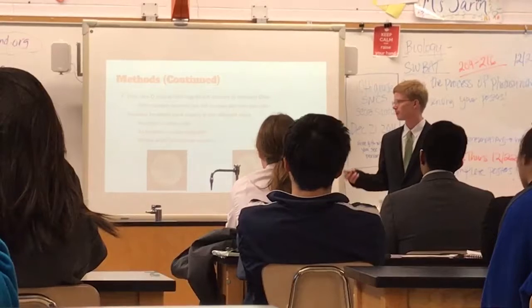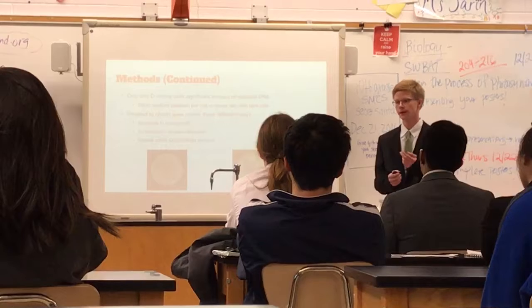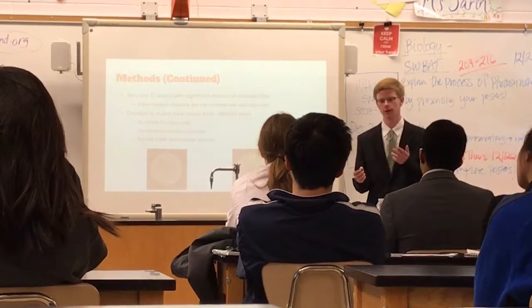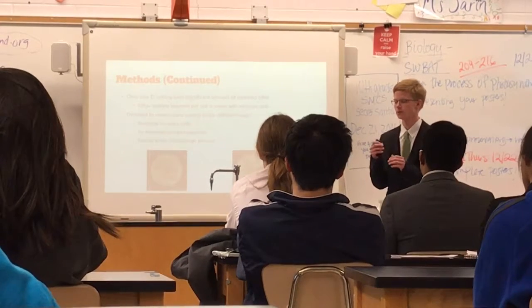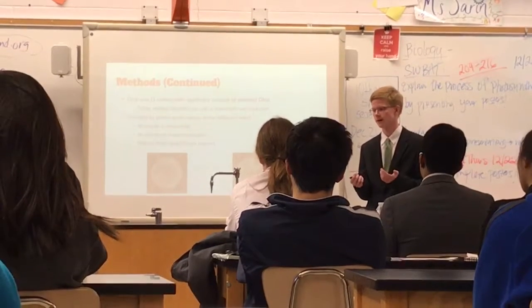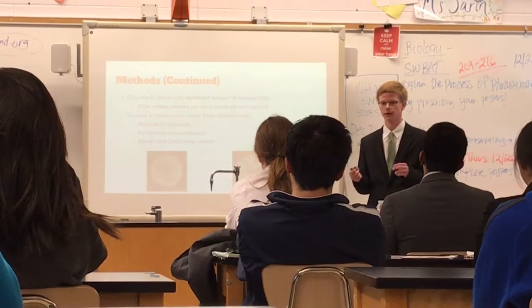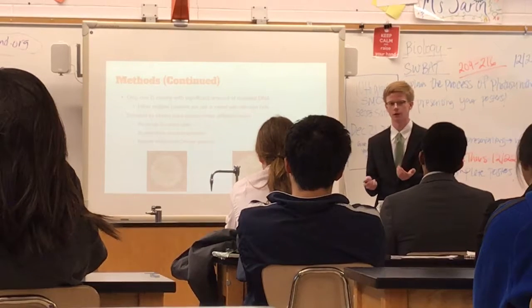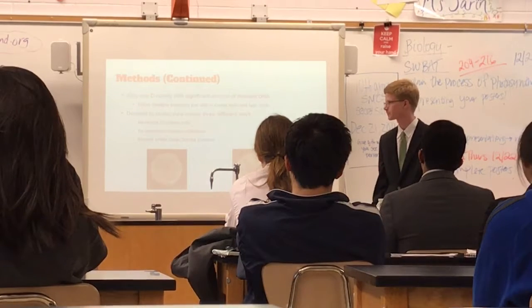So there are two situations that could have caused this. Either two plasmids got incorporated into the same cell, which is very rare but could possibly happen, so the template and the mutated DNA got into the same cell. Or, when E. coli colonies grow, they usually start from one cell. So if the double plasmid theory didn't work, what must have happened is that two different E. coli cells actually started the same colony together and meshed this DNA, which is rare because there are only 4 colonies growing on pretty separated parts of the plate.